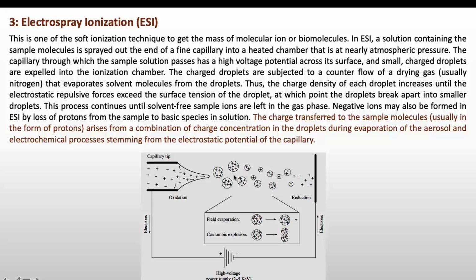that evaporates solvent molecules from the droplets and converts them into smaller droplets, at which point the droplets break apart into still smaller droplets, and this process continues until solvent-free sample ions are left in the gas phase. So finally we are getting ions here. Negative ions may also be formed in this method by transfer of protons from the sample to basic species in solution, and the charge transfer to the sample molecule arises from a combination of charge concentration in the droplets during evaporation of the aerosol or cloudy form, and the electrochemical process stemming from the electrostatic potential of the capillary here. So this is the electrospray ionization method to convert the sample into ions, and this is a very soft technique.